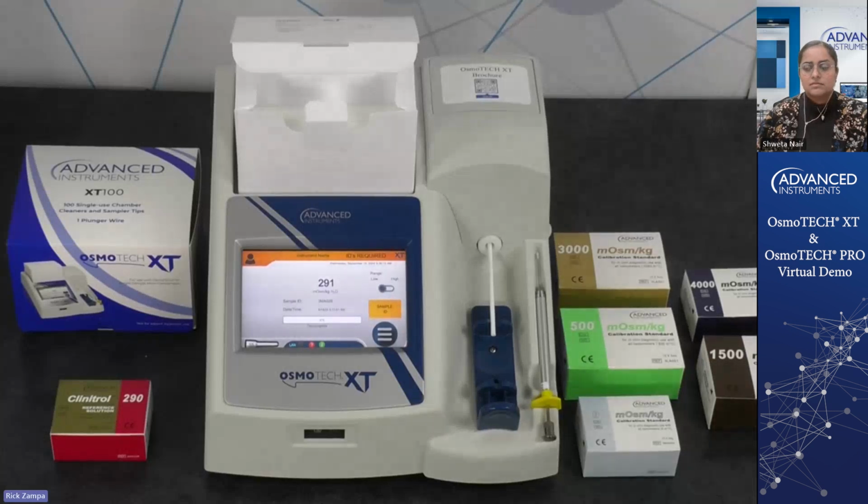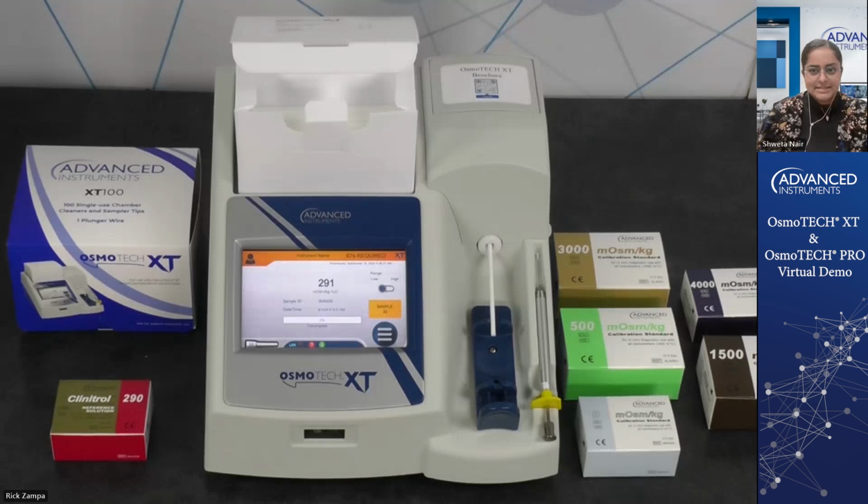We also recommend that you run the 290 every time you run the instrument as an instrument check, to assure that your instrument is operating properly, because that's how we recommend that being done. Did I cover all of that? I think so. Yes, I think you did. Okay. Perfect. I think that's good for now.